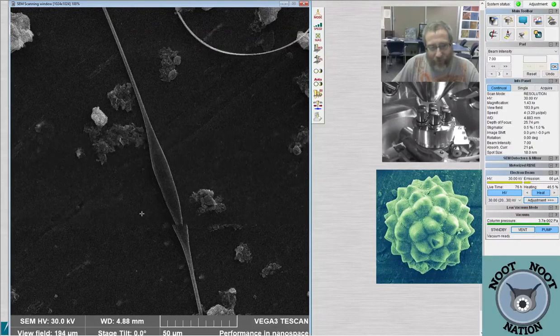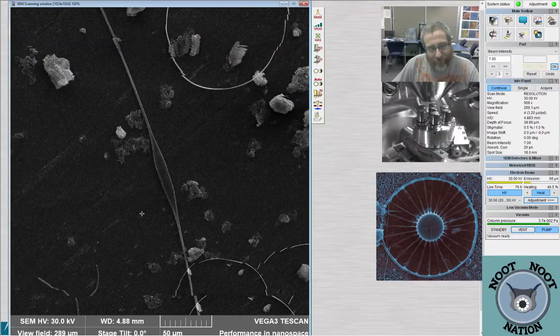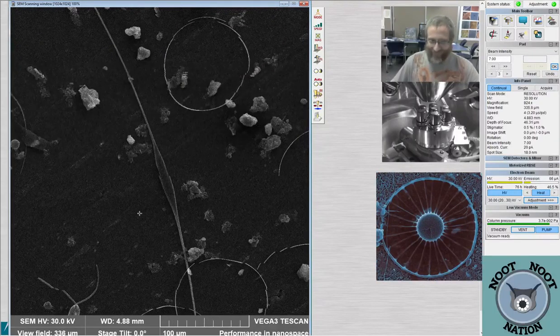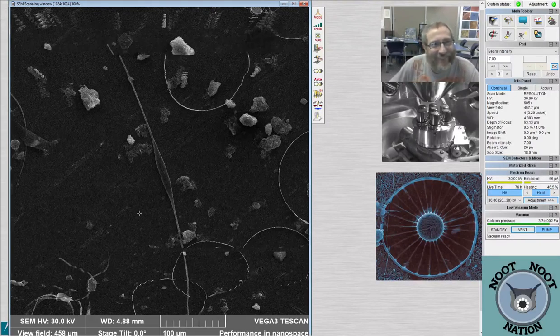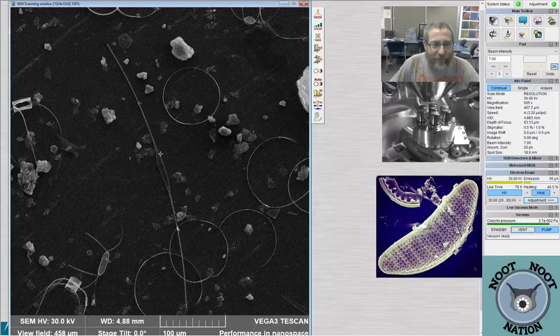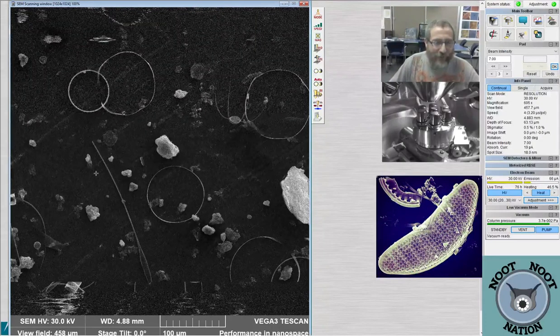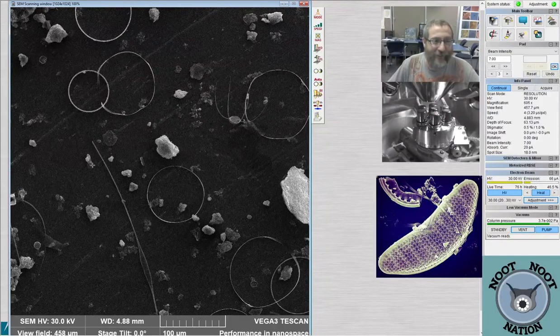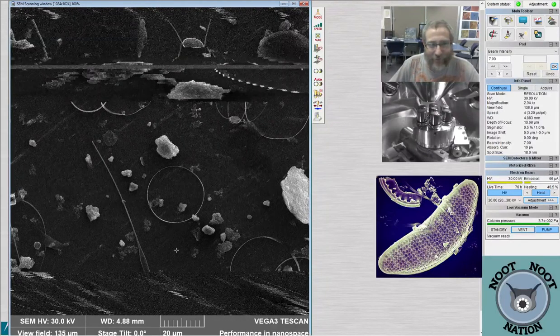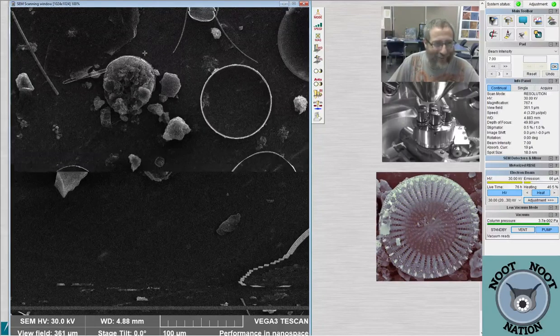Do you know what we're looking at here? I would like to say Cylindrotheca, but yes, I don't know. It's Cylindrotheca. I'm pretty sure that's what it is. It just looks so different close up. I asked you last night, we saw one in the light microscope, and I asked if you knew what it was. And I think something happened, and I moved on before we ever addressed it.